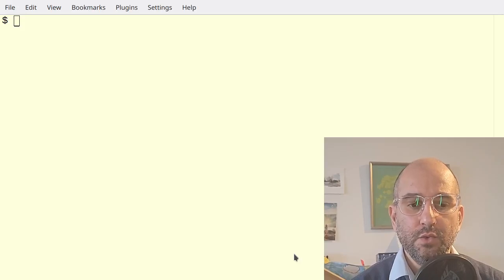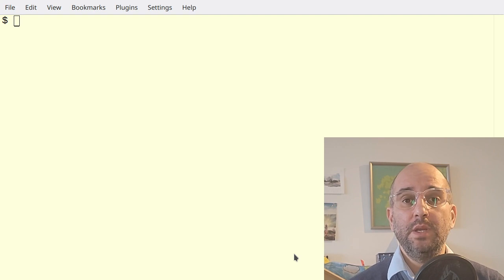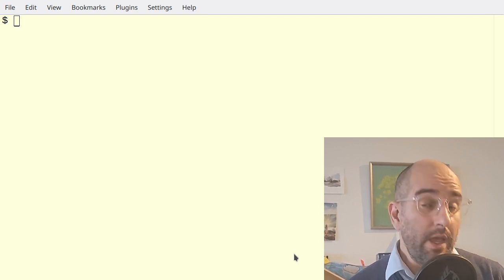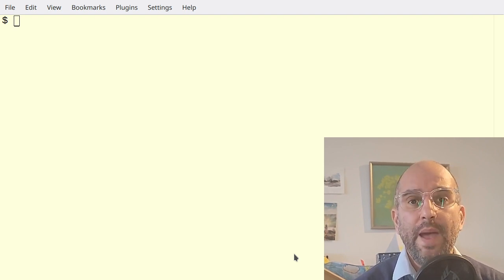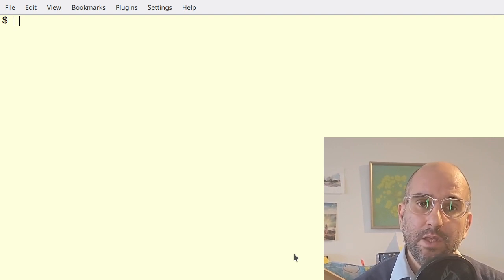Hello. So today I'm going to show you how to use the mags from GMGC. GMGC is the Global Microbial Gene Catalog, and mostly we discuss it as a gene catalog, but actually we've also made available a lot of mags, metagenome-assembled genomes, for all of the habitats in the data set.